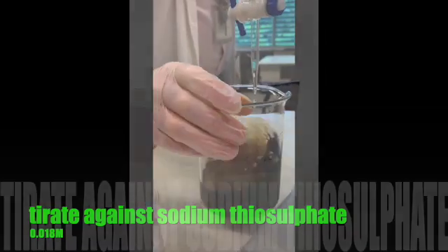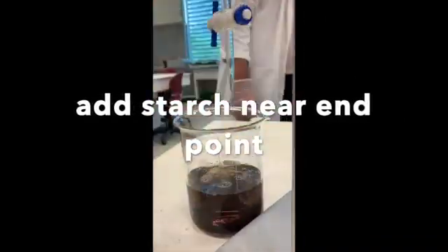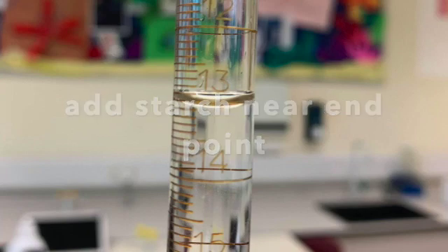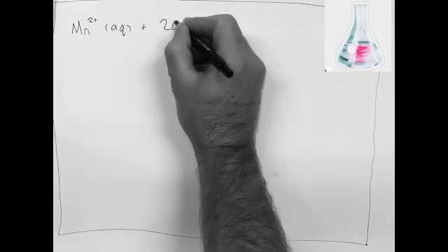Against sodium thiosulfate, concentration 0.018 moles per decimeter cubed. 13.1 cm cubed was our value. So let's have a look at the chemistry.